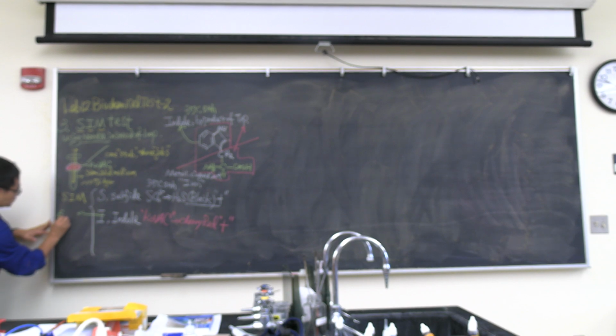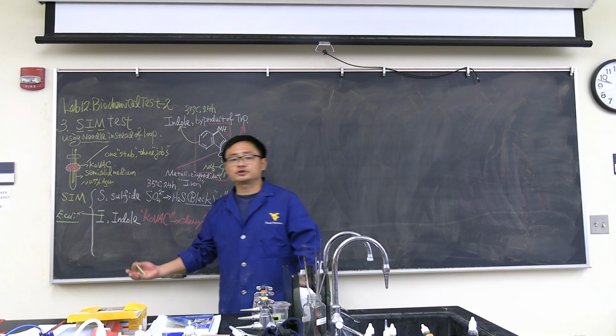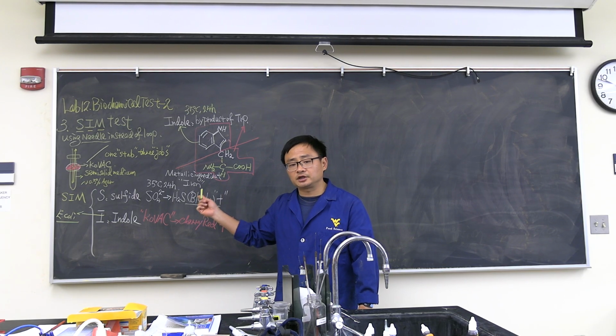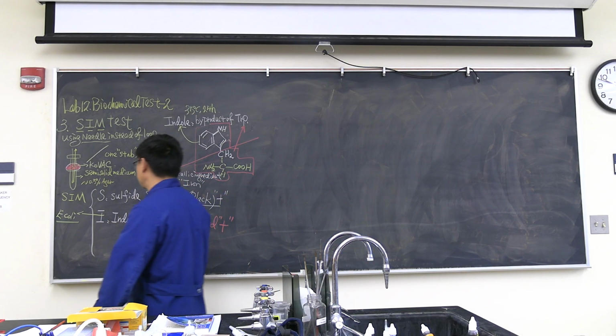Everybody knows it is E. coli. A very quick test. So the rapid testing research area has been developing different methods specifically for E. coli. One of the methods is testing indole. If the bacteria generated indole, it's very possible it is E. coli. Okay, so that's I.